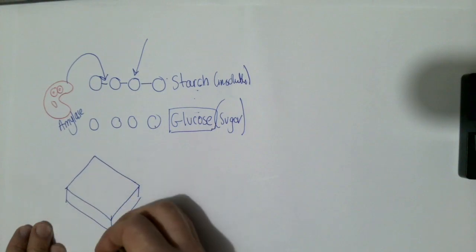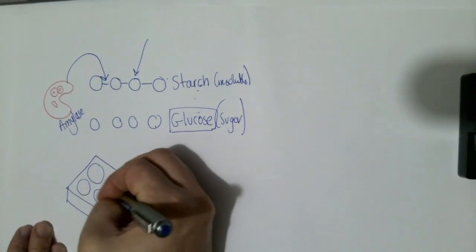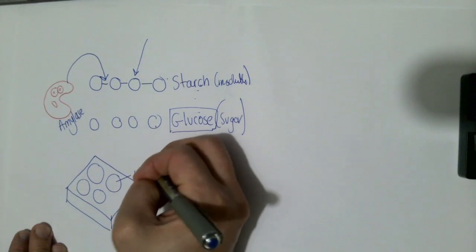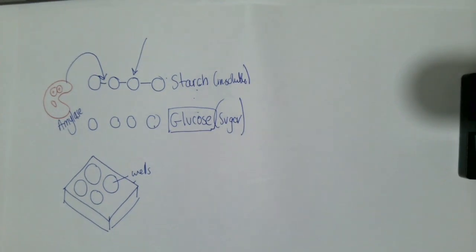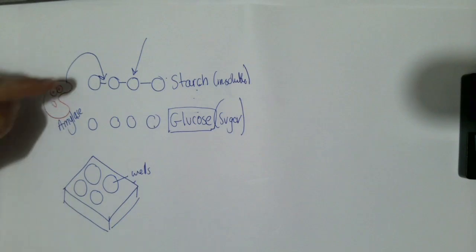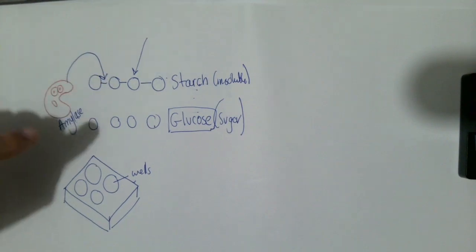That's the first part of the knowledge that we need to be successful within this required practical. There's so much going on. This here, we've all seen these in the science lab, is what we call a white tile. It's got wells to hold solutions or liquids that we can put things in. So in this investigation, it's all based on this.